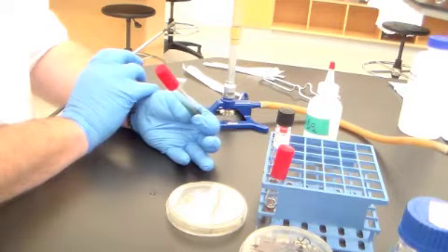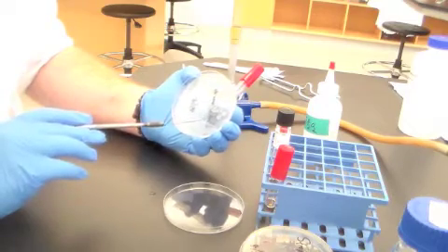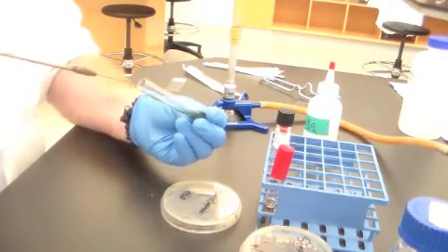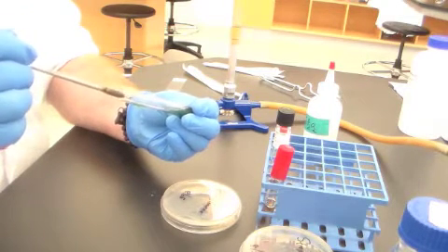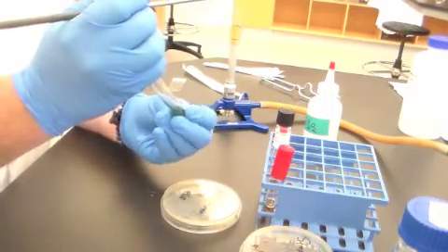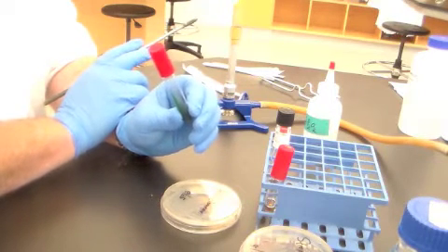This is a slant media. You can, if you want to, stab this slant media, but it's not necessary. So I'm just going to take, again, as my example Enterobacter cloacae. I'm going to inoculate this agar media. And I'm using a loop, and I think a loop is the best way to go on this. I'm just going to smear that across the top of this, all over the slant. I'm not going to bother to stab this, mostly because, as it turns out, this is a trivial thing: any bacterium that can use citrate only does so aerobically.